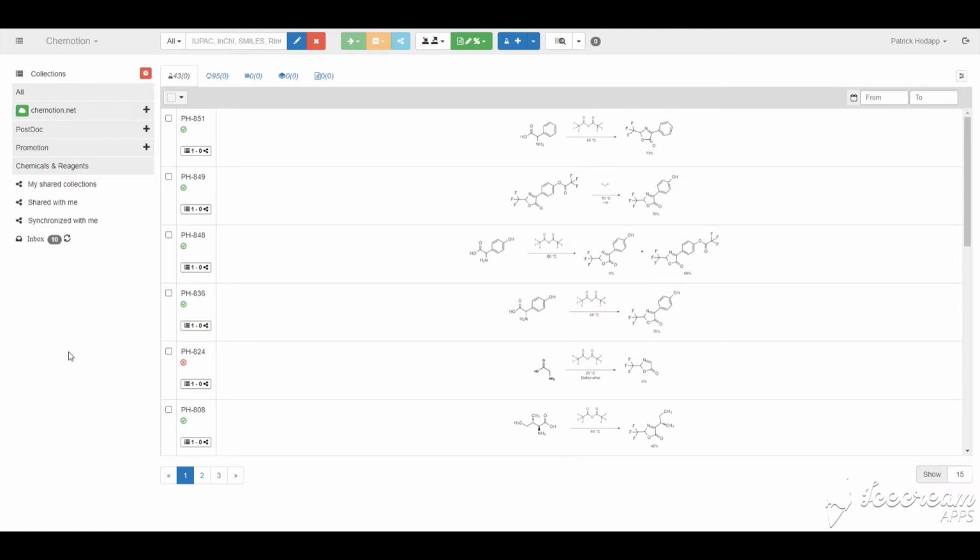Let's look at the arrangement, how the ELN is organized, what you're looking at, and then go through the main functions of the ELN. Due to time constraints, I will not have the time to go into each of the functions in depth, but you should have a good overview of the capabilities the ELN offers. So in the top of the window, you see the administration toolbar. This has the possibility to search. You can move your reactions, delete reactions or samples, export reporting, and the account administration.